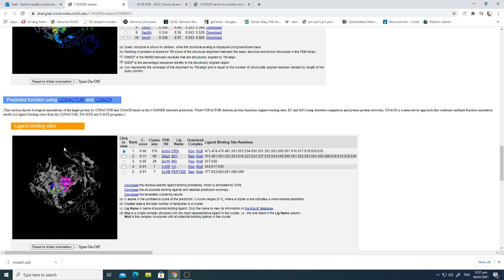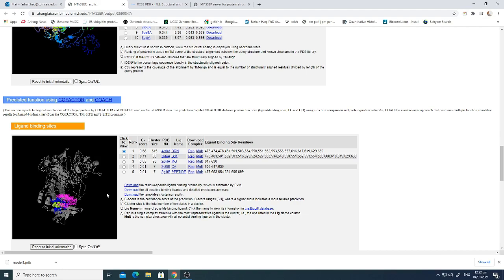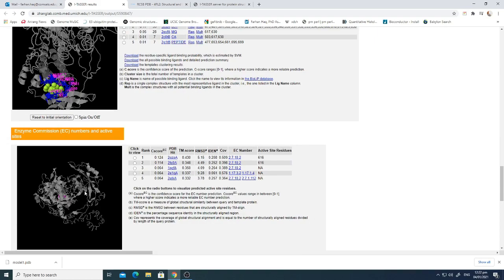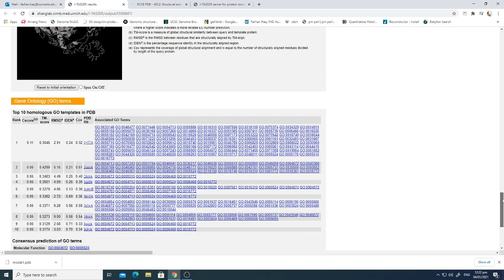Predicted function using COFACTOR and COACH is also provided. You can look for sites where ligands can potentially bind by clicking the 'View' option to go to the region with possible ligand binding. Enzyme Commission numbers and active sites are also available to explore.